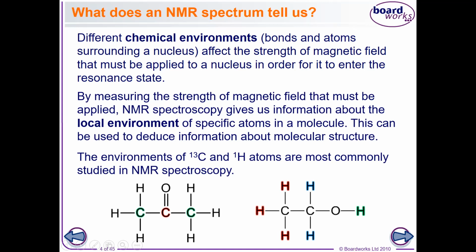Anyway, on the right-hand side molecule, which of course is, okay, so hopefully you just said ethanol, you'll notice there are 3 different environments for the hydrogens. The left-hand hydrogens are all identically placed, so they will obviously have 1 signal. The 2 blue hydrogens are in a different environment. They will produce a 2nd signal. And the green hydrogen is yet in a 3rd environment. You will see in this case a ratio of peaks. There'll be 3 to 2 to 1. And hopefully that should make sense.